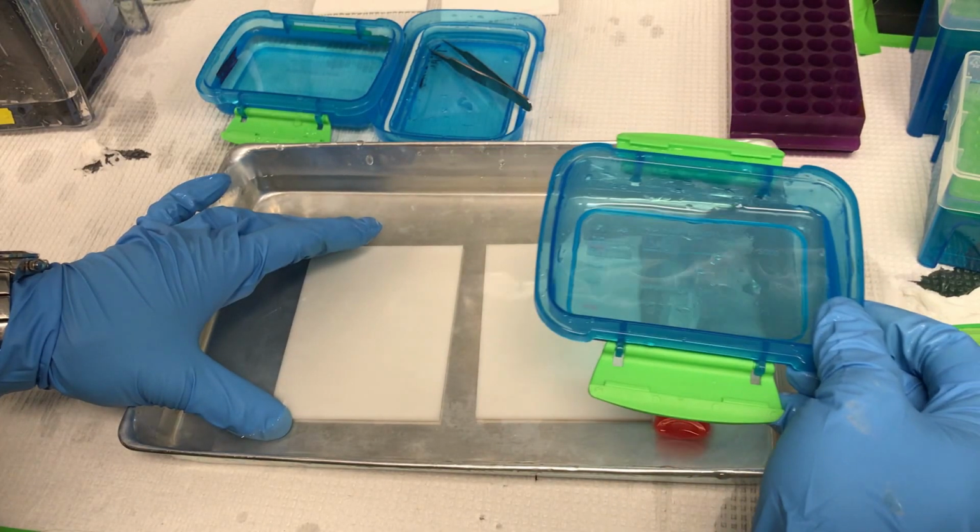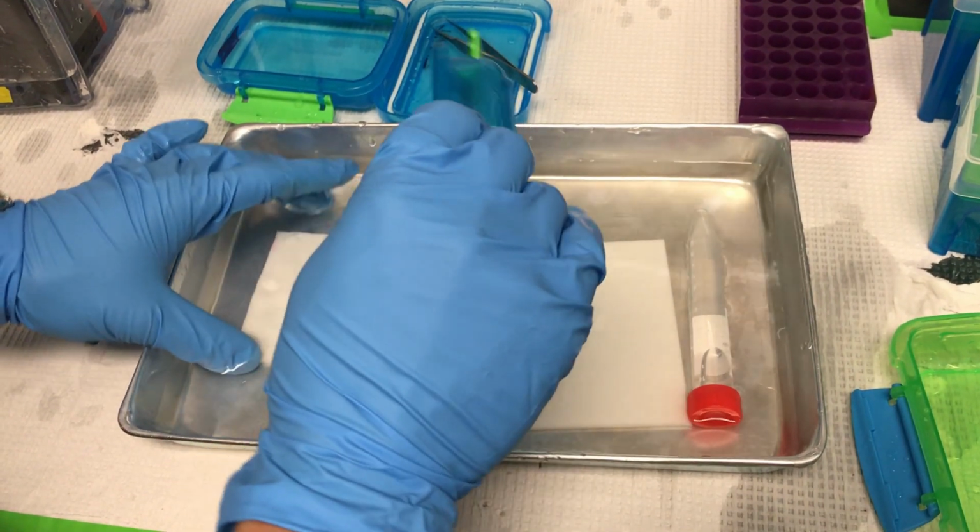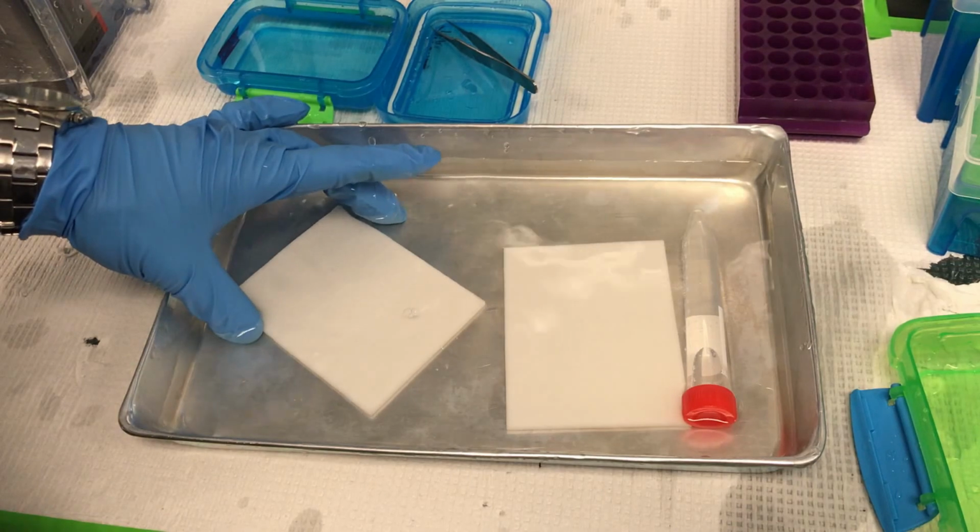Now create the transfer sandwich. During this process, everything should be wet in the transfer buffer.